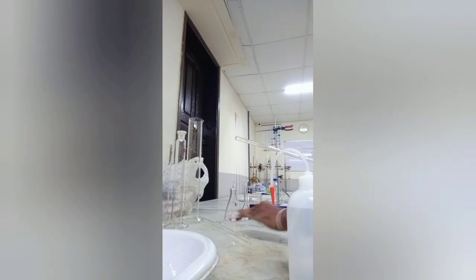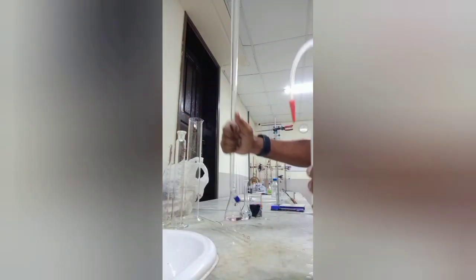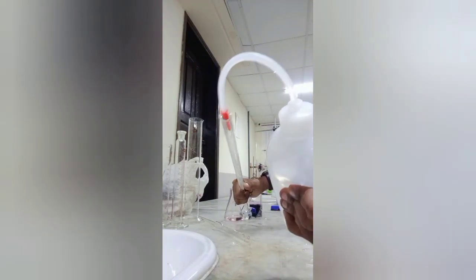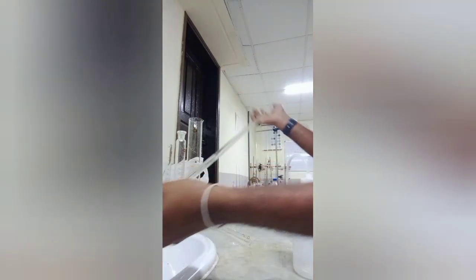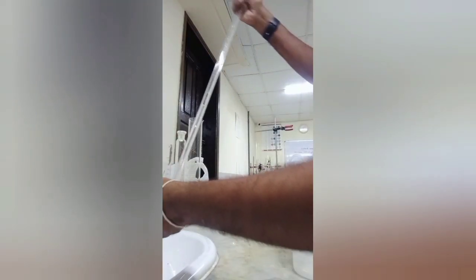Washing the burette, also you want to do the same thing. Check whether the bottom part is closed. Then add water in the mouth, and then do like this, before doing and after finishing. Washing the burette is like this only. Then open the knob.